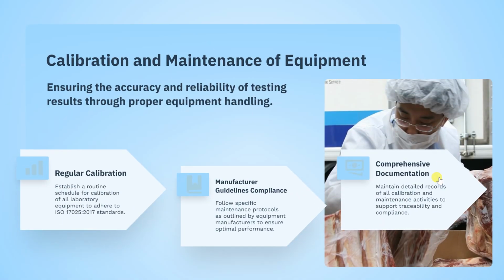Now, calibration and maintenance of equipment. This is where we get the most headache in laboratory management. Why? Because most of the time, if equipment or machines are down or broken, it's very, very difficult to fix them because few resources are put into many of the food laboratory activities or equipment.